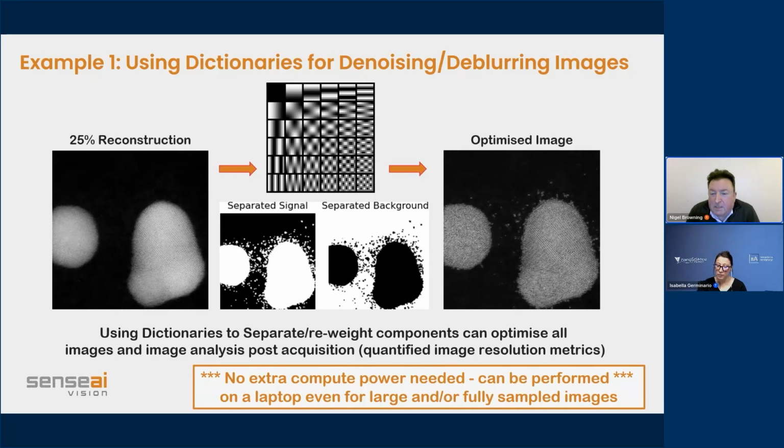So I will answer a different bit of that question, which is that essentially the compressed sensing is not a machine learning model per se in terms of what goes into that. It's a reconstruction model. But absolutely, we can use the compressed data to do a drift correction in that process. By definition, if you have enough sampling to reconstruct a full image, it means that anything you could do to that full image, you can do on the compressed data set, right? The mathematical methods can be applied sequentially, or they can be applied at the same time.